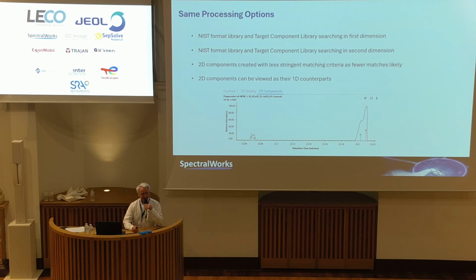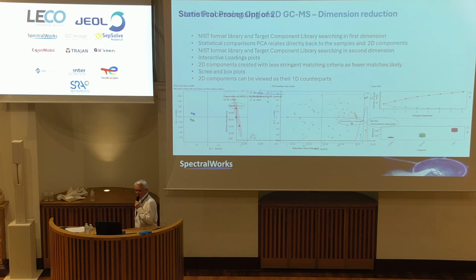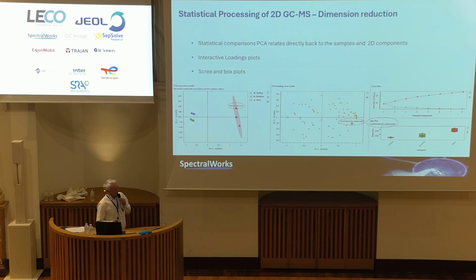Now, let's move on to the statistics proper. This is the kind of PCA analysis of 3 whiskies, very close to my heart. And what we see is obviously the statistical PCA separation. We're only looking at 3 replicates, which is not great, but it's there.